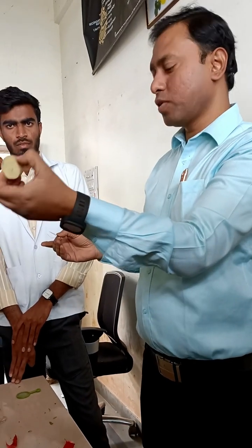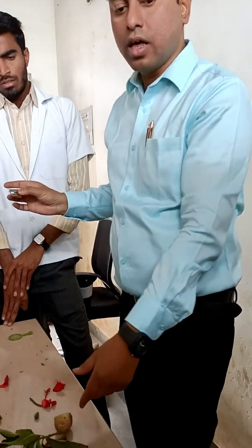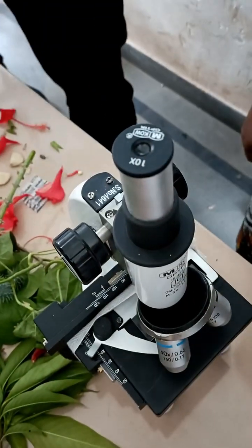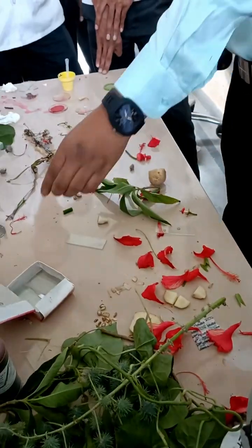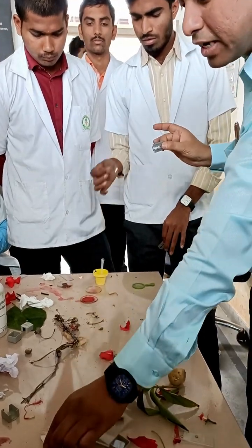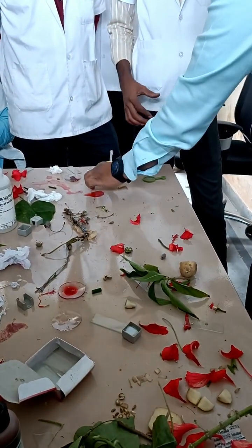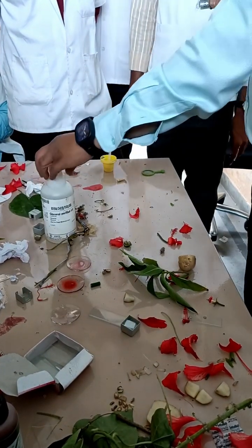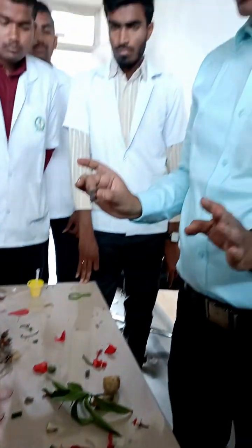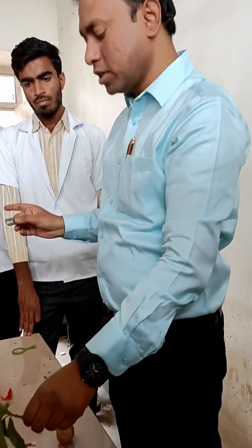That is the Adhatoda vasica, and these are the materials: a compound microscope, slides, cover slip, and petri dishes — one containing water, second one with safranin solution, third one with water and glycerin. These are the things required to do the practical of Adhatoda vasica. Now, the first thing we have to do — take the potato cube.